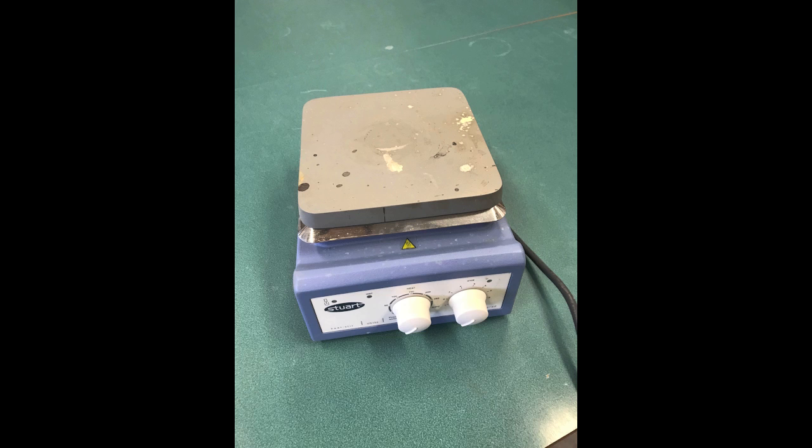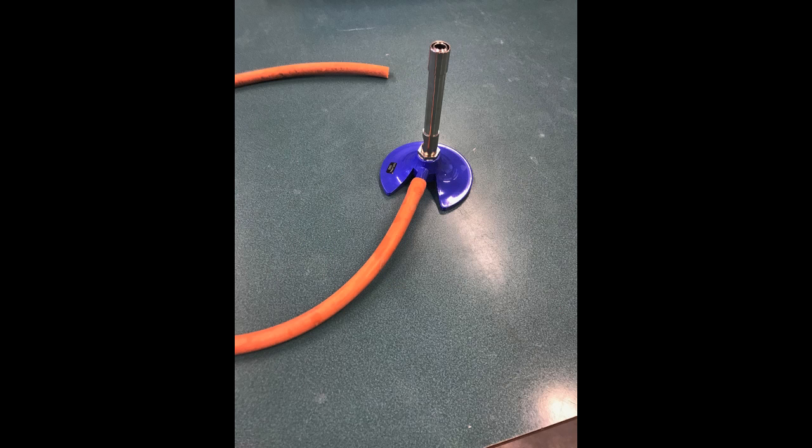Hot plates are electronic ways of heating up liquids, good for flammable liquids. Whereas Bunsen burners use flames and should not be used for flammable liquids.